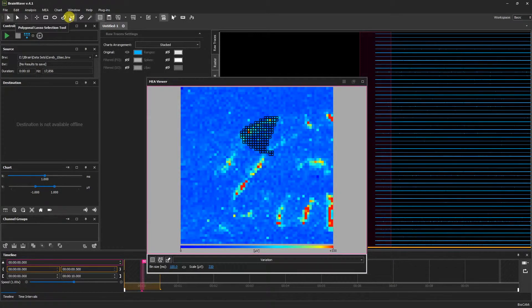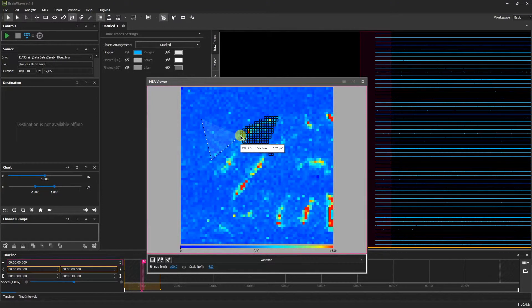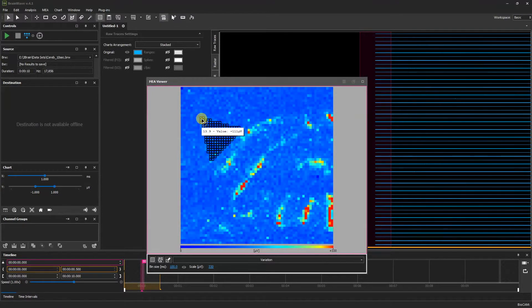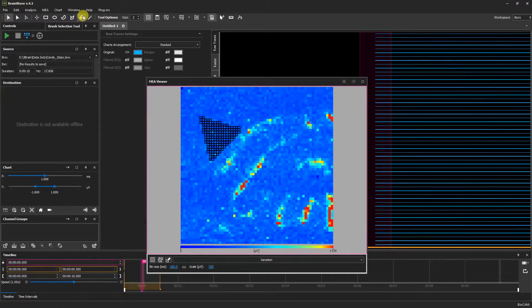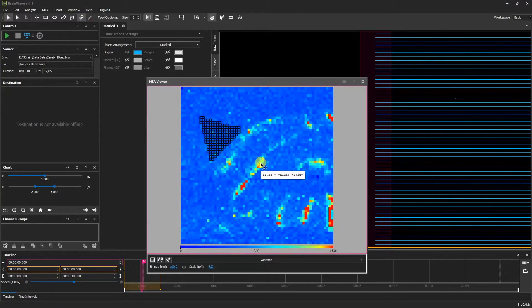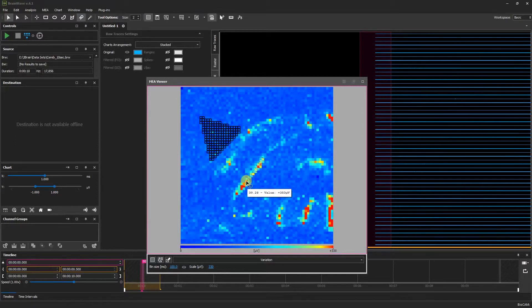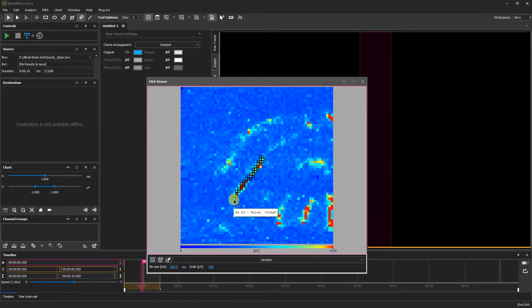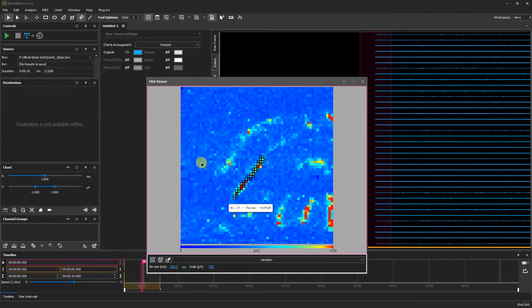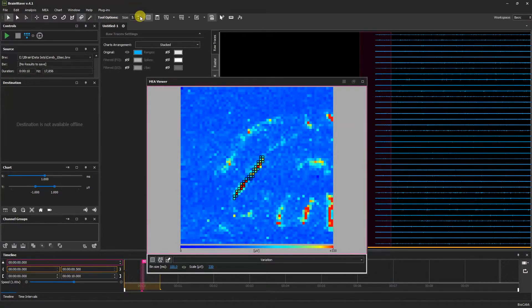We also have the Polygonal Lasso Selection tool that allows us to make more geometric selections. With the Brush Selection tool, we can more precisely click and drag to select our data. We can also change the brush size.